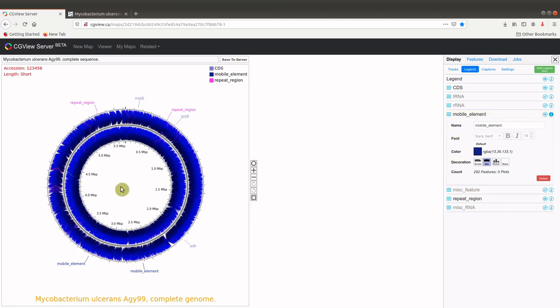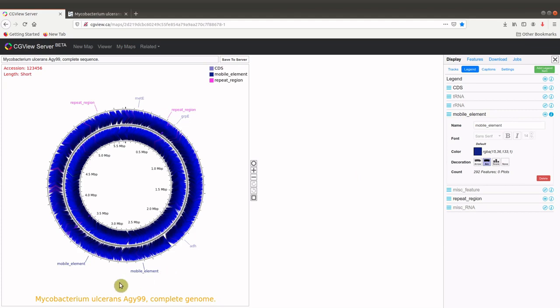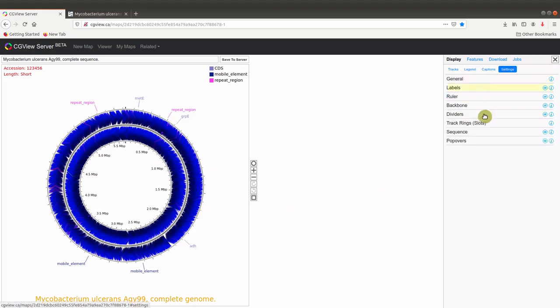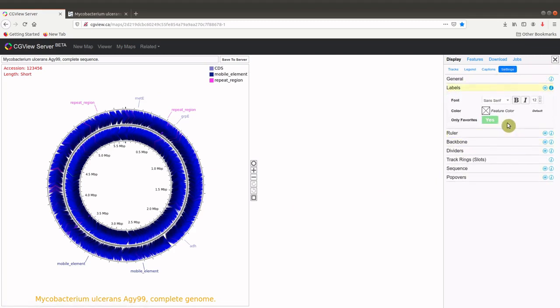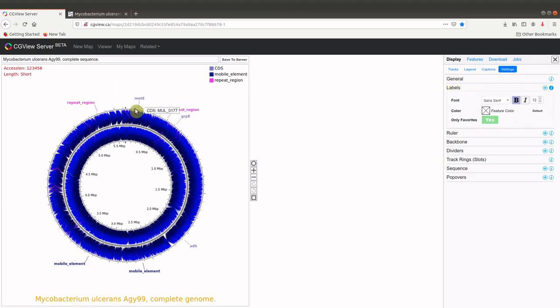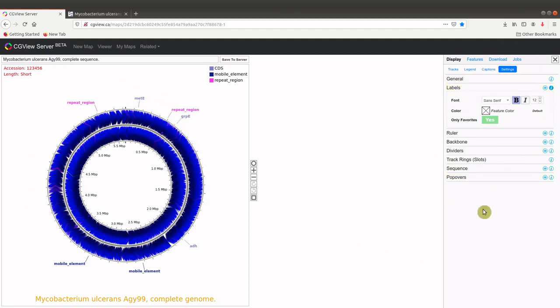Now, if we are done with this, we can also make some additional modifications. If you want, let's make this bold. All the labels here, let's make them bold. So to make them bold, we'll go to settings and then we'll go to labels and then we'll make them bold. So notice that they are now bold. So it depends on how you want the map to be represented. You can make some of these modifications here.